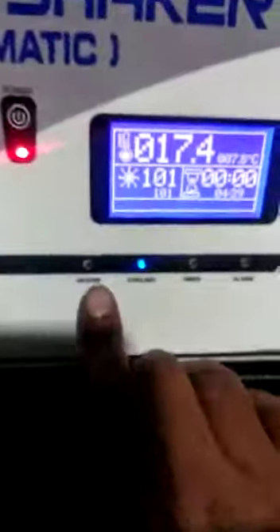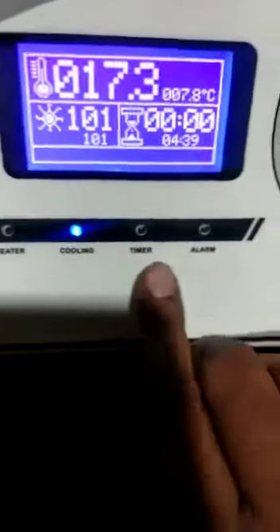This button will enable and disable this indicator. This indicator is the cooling indicator and timer alarm.